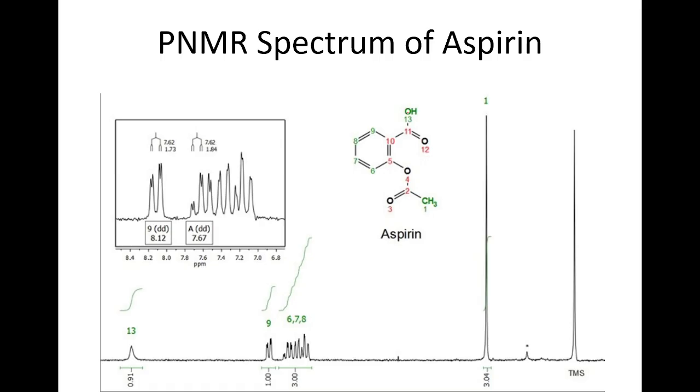Right? We haven't counted any hydrogen. There is a hydrogen here, yes, and I'm just going to draw a line so we know there's a hydrogen there. There's another hydrogen there. Do we have hydrogen here? No. Hydrogen here? No. So that's all the hydrogens we have. In fact, I'm going to draw more. Do we have any hydrogen on this carbon 5? No. There's 1 bond, 2 bonds, 3, 4 bonds. So no hydrogen for this carbon. And this carbon here, 1, 2, 3, 4, no hydrogen for that one.